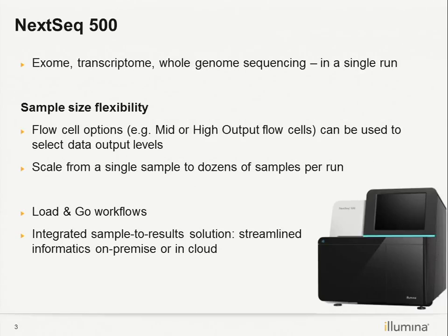It's just like a map for the software to know which file to grab, to do the demultiplexing. So you have your run data, a Linux computer installed with the free bcl2fastq, and you prepare a sample sheet, then you launch the software and convert the base calls into FastQ files.